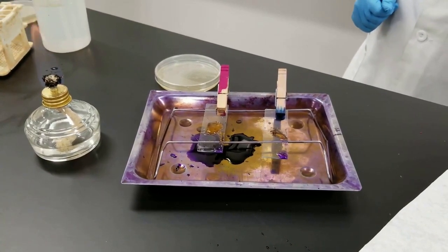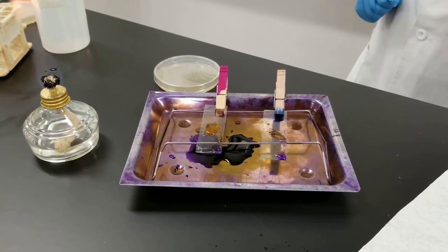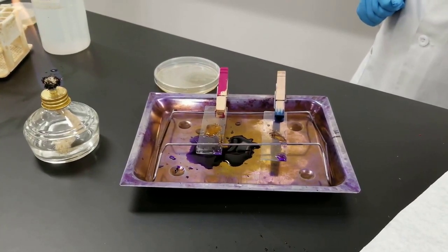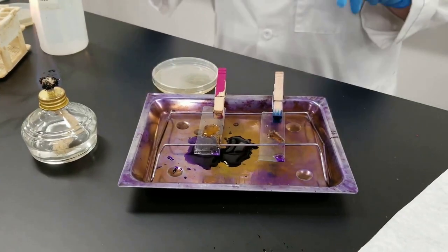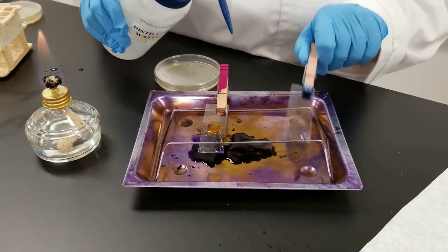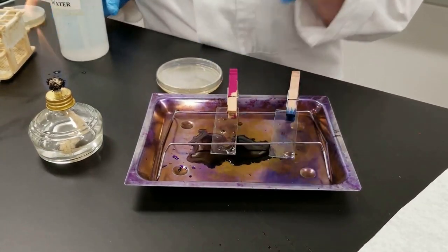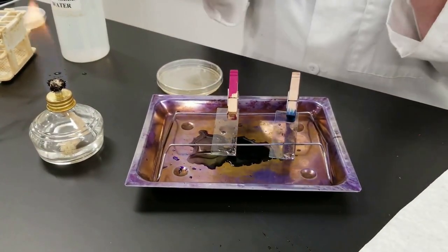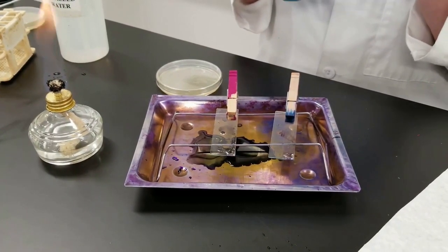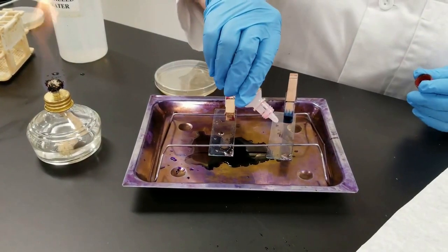So I say the iodine, it will remain on for a minute. So crystal violet was a minute, rinse, iodine's added, on for a minute. And now we are going to rinse that off once again with distilled water. Now the third step is ethyl alcohol. Some people say add this on for 15 seconds, rinse it, do a second 15 seconds and rinse it. I prefer to add it on for 30 seconds.